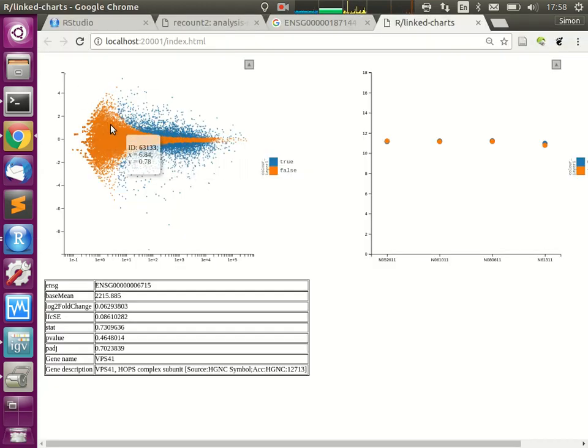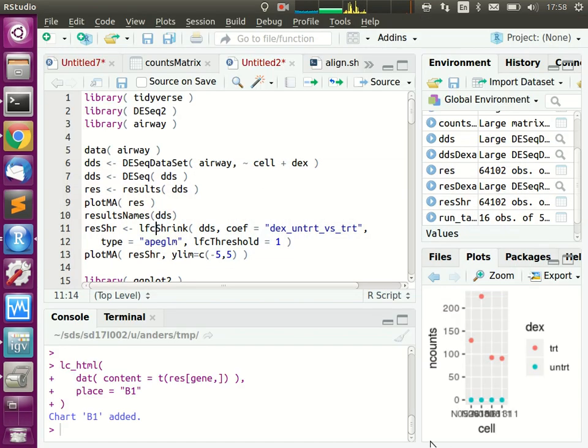You see that even the non-differentially expressed genes, so those where we are not sure about the sign, have changes up to 10-fold up or down, simply because we are here in the region of having only 1 or 2 reads per sample, and a read extra might let the fold change appear 2, 3, 4 times. So what we actually want is to shrink down these exaggerated fold changes, such as to have them both at the same time.